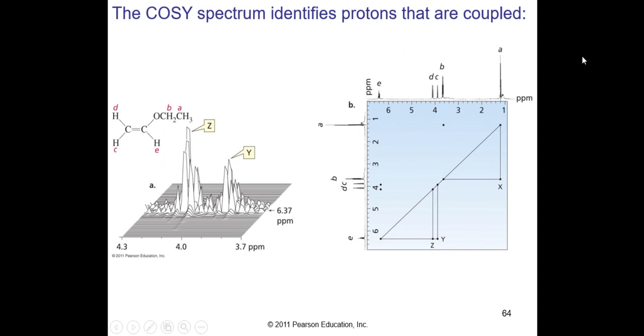This is a COSY spectrum. That will identify protons that are coupled. There is a vinyl ether, and we're seeing A, B, C, D, and E. There's your vinyls at 6.37, and this enables you to identify protons that are coupling with each other. This is a more advanced technique used in natural products analysis. Cross peaks indicate pairs of protons that are coupled.